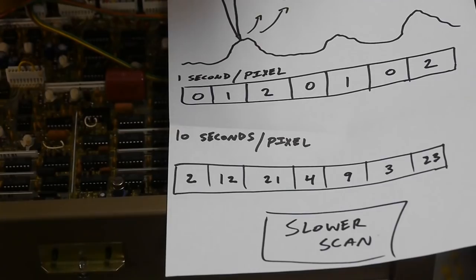So we're running out of tricks, but there is something else we can do. We can actually slow down the speed at which we scan the beam along the sample. So if we're only getting two electrons per second here, if we stayed over that spot for a good 10 seconds, we might find out that we collected a total of 21 electrons.